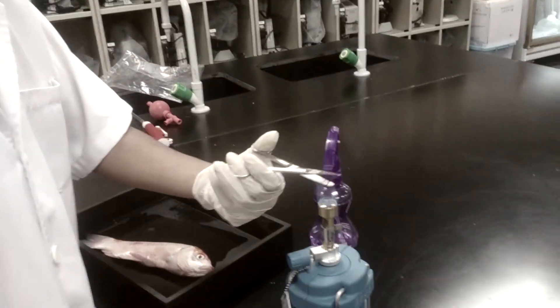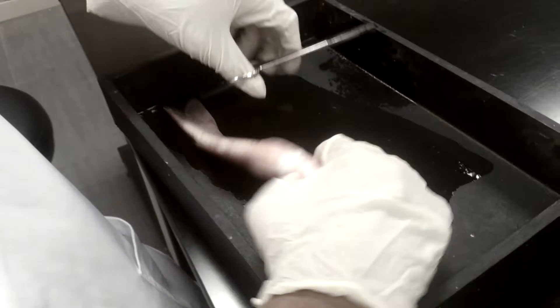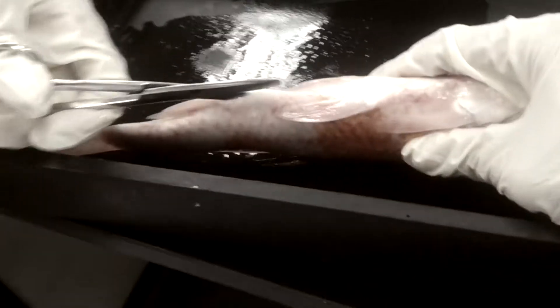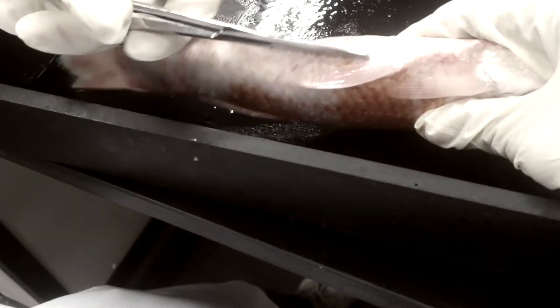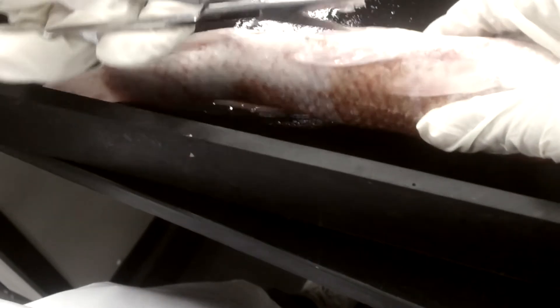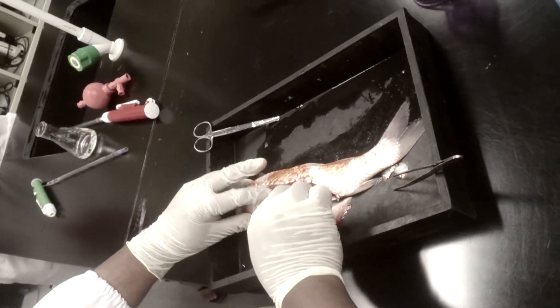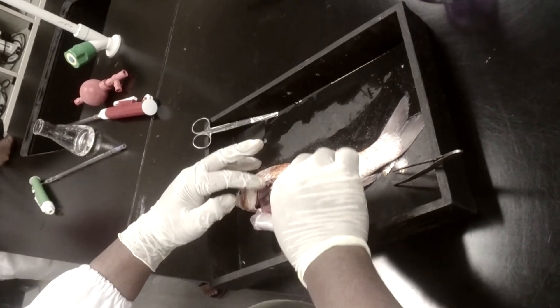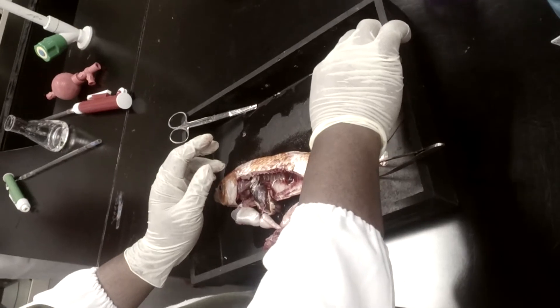Before we dissect the fish, we must immobilize the fish, and then we can cut the fish open from the anus straight to the belly. And then we take out the internal organs. Then we check the organs whether they have any abnormality or not.